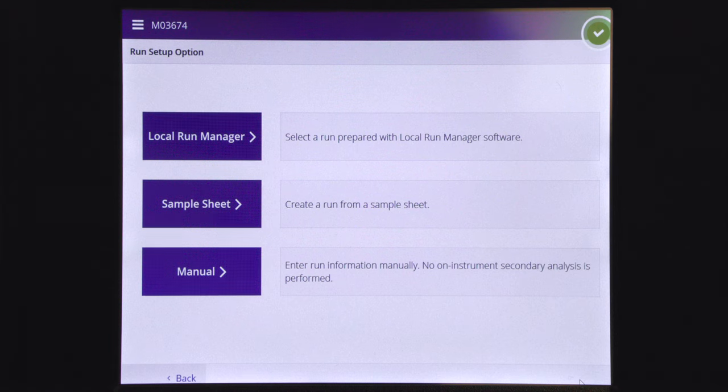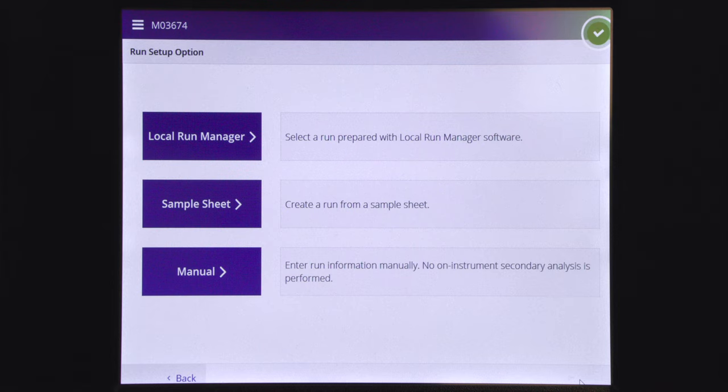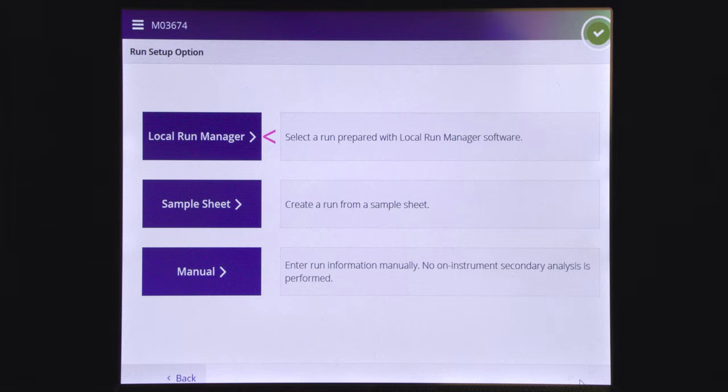When starting a MySeq run there are three run setup options: local run manager, sample sheet, and manual. In this video we will show you how to set up a run by using local run manager.